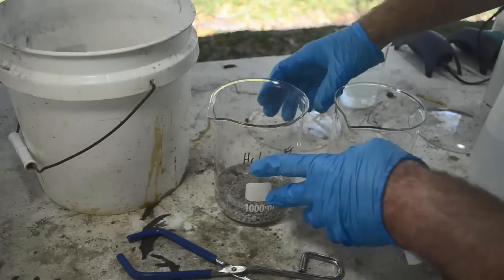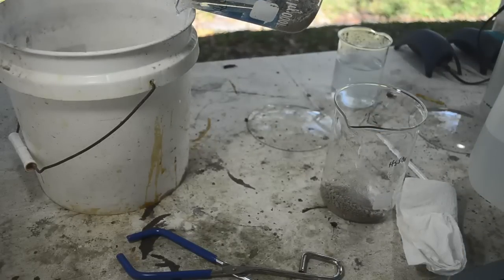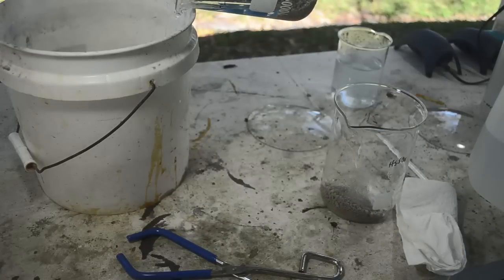I'm going to call that neutral. It was very close before. It just had a slight tinge of orange on the litmus paper. So I would say that these are both done.